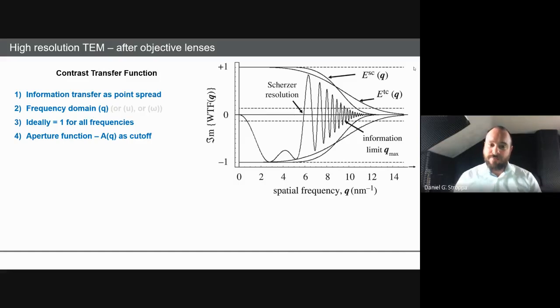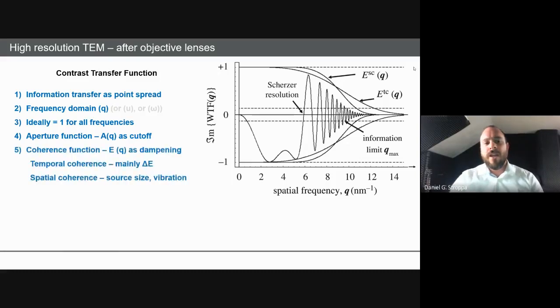Ideally, we want all the electrons to be at 300 keV after acceleration, but there is a deviation, so there is a delta there. Also the emission size is not point-like, there is a physical size of emission, and all of this impacts the coherence of the electron wave and how far you can get with the spatial frequency transmission.